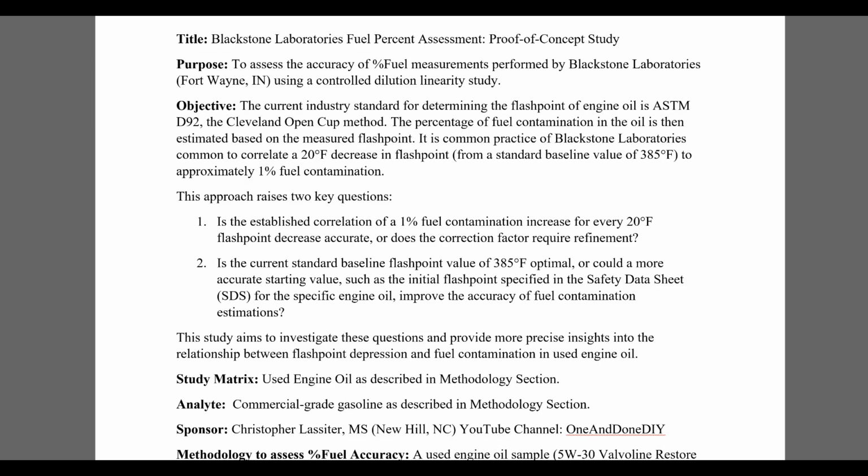This could be done much more thoroughly than what I did here. But be that as it may, this is just what happened. I'm just a guy who's curious and wants to share this on YouTube with his community. So this is what we have here. So what was the purpose? Our purpose here was to assess the accuracy of fuel percentage measurements at Blackstone Labs, and I wanted to use what I call a controlled dilution or linearity study.